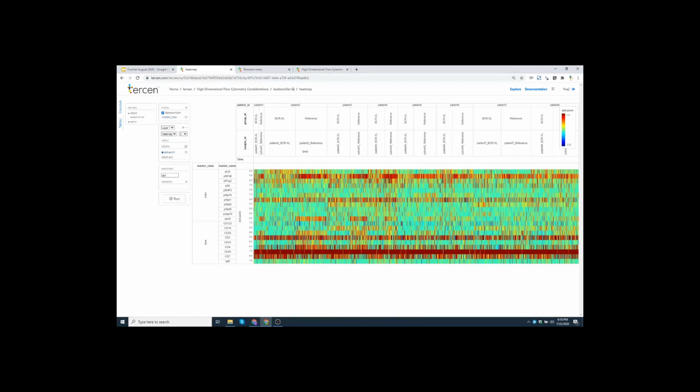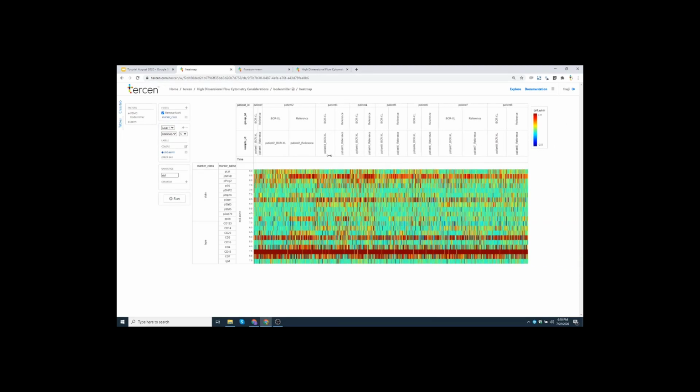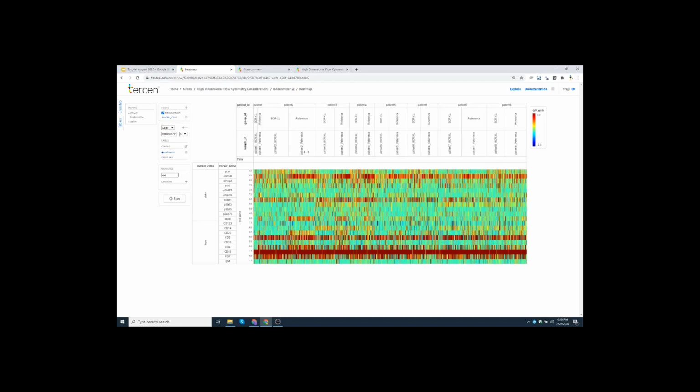You can also see patient 3, patient 4, patient 5 looks different. So we see that there are these systematic but important biological variations. And what's great about Lucas Weber's approach is that he can handle this. This is called a paired design in experimental design, where the treatment group is compared within each patient first, because each patient has its own variation. So this is a paired two-group comparison.